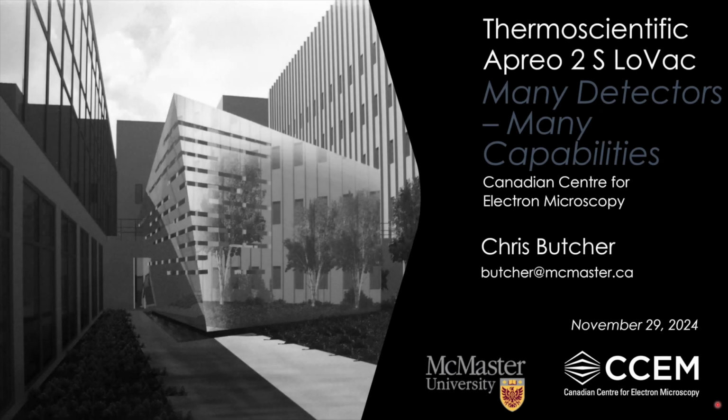Okay, well, welcome everyone. Today I'm going to be talking about the Apreo. So this version is the higher end version, which does have low vacuum capability. I've been a technician in the CCEM, the Canadian Center for Electron Microscopy, since it started. I've been doing electron microscopy for 40 years, so I have quite a lot of experience with SEM.